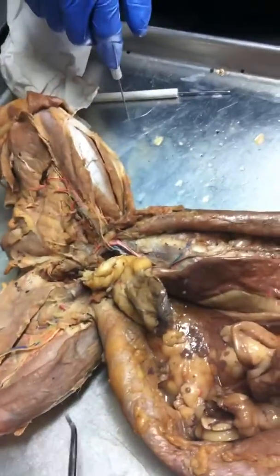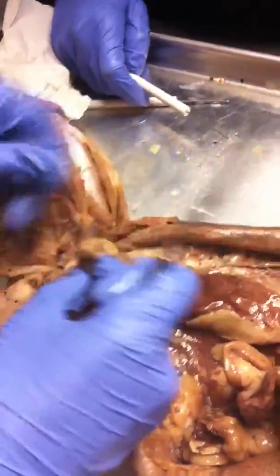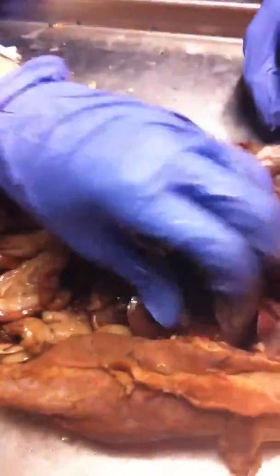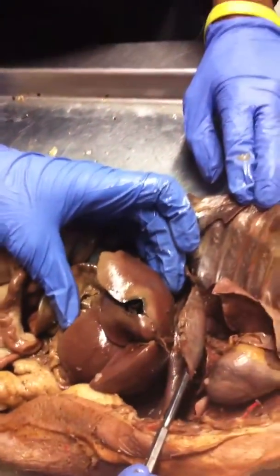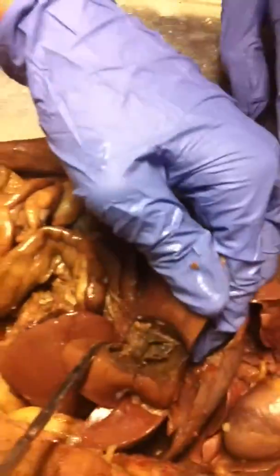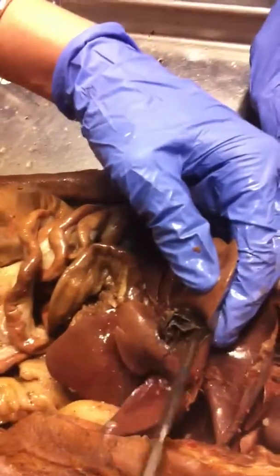Show me the urinary bladder. Urinary bladder is right here, and I think it's either flat or cut open, I can't tell. Okay. Show me the liver. Liver, right here, real big, many lobes, right underneath the diaphragm. Okay. Show me the gallbladder. Gallbladder looks like it's been kind of cut up a little bit. So it's greenish, bluish, this little pouch right in between these lobes.